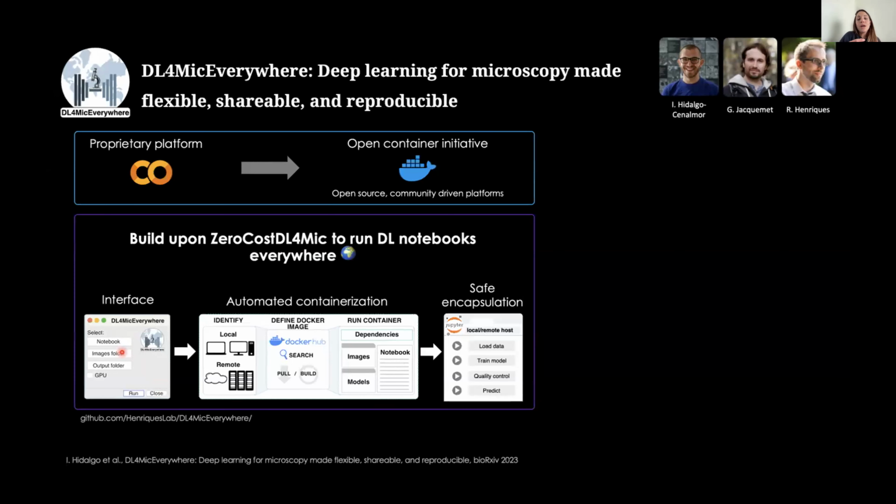So you don't need to care anymore about privacy issues with Google Drive, for example, or you can use basically all the technology that you have in your research institute to access these terabytes of data that usually they need protocols to share the data and these sort of things. And then you choose where you want to save your results.